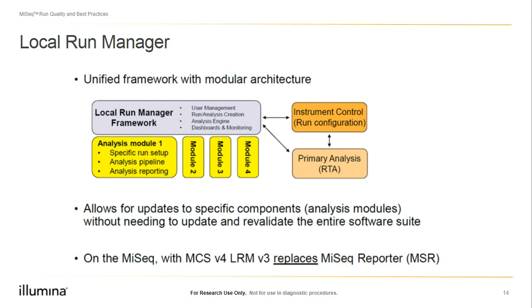On the MiSeq with MCS version 4, Local Run Manager V3 replaces the MiSeq Reporter. It's not listed here, but I also wanted to mention that on MiSeq Control Software version 3.1, we will be using Local Run Manager V2, which will come into play when you're downloading your analysis modules. V3 modules are not compatible with V2, and vice versa.